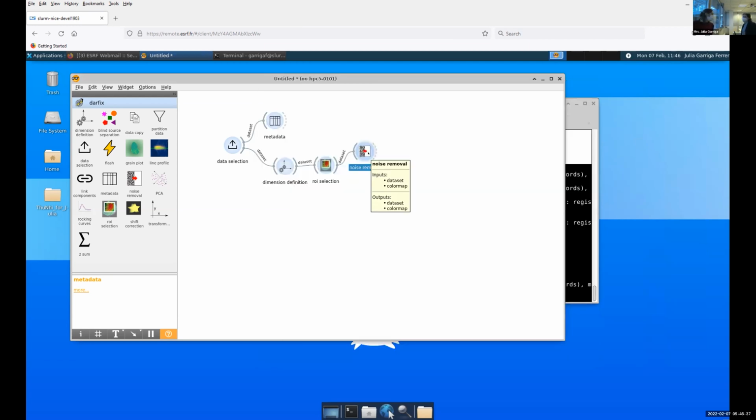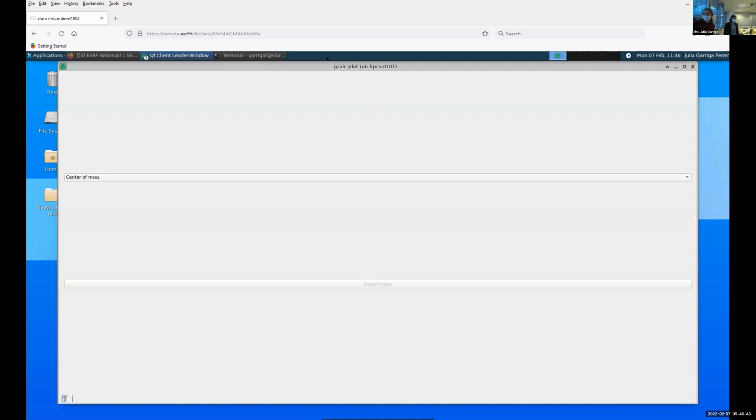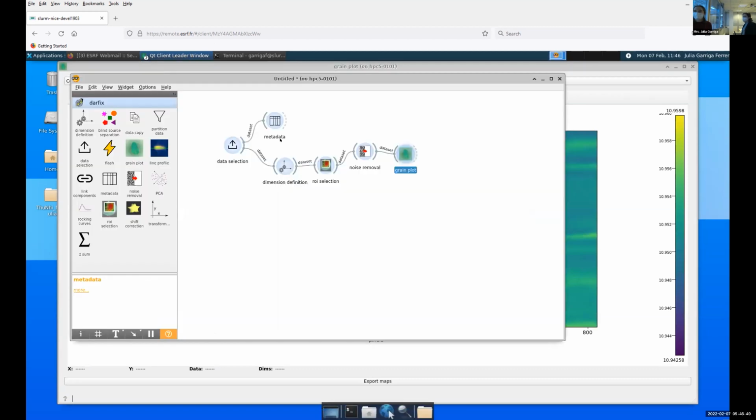Here we don't do any shift correction. No, because first it cannot really find it, and second it's very small. If you try to do a shift correction in this one, if you do it automatically, actually it finds 13 that it's not real because of the stripes that are all in the same direction. The shift correction gets confused, so it finds the distance between stripes instead of the real shift. Exactly. Sometimes you have to work with what you have.